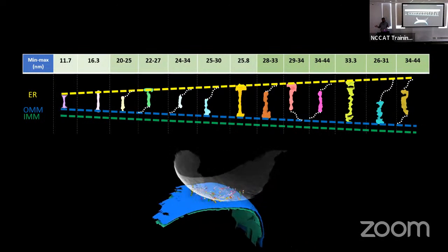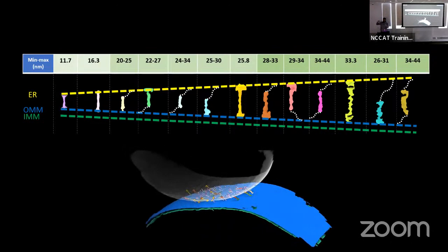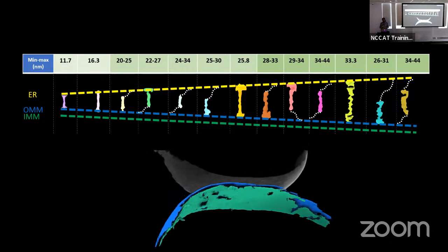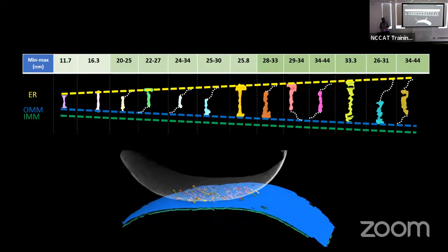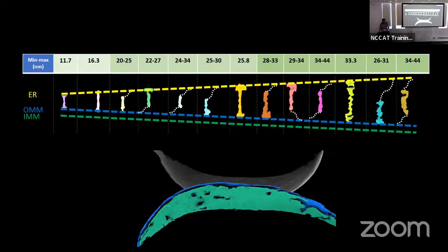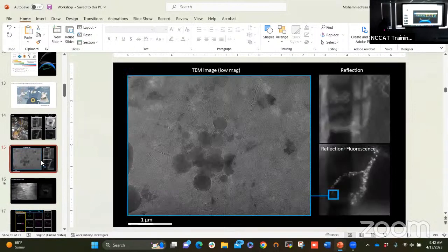But my system is altered. My mitochondria are mostly globular. I don't have many tubular mitochondria, and they're meaningfully different types. So the first example of mitochondria I showed over here, this long mitochondria, is an example of unperturbed tubular mitochondria. Whereas the ones I have are usually about this size.